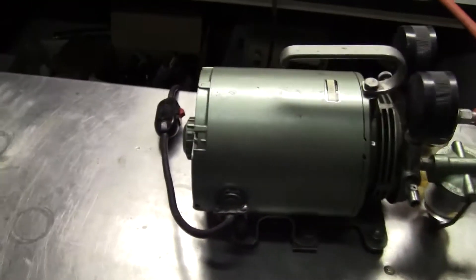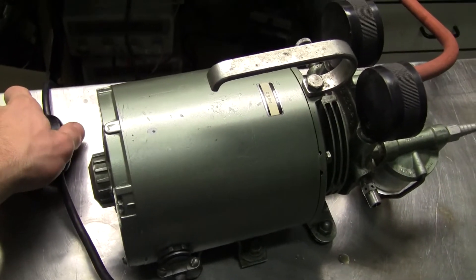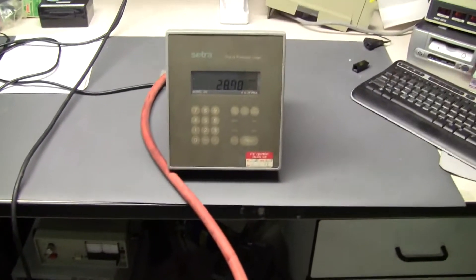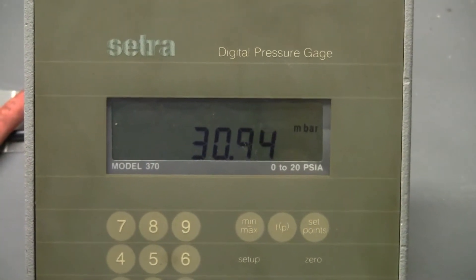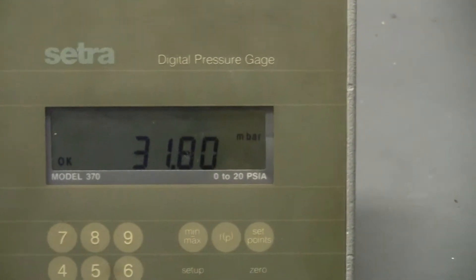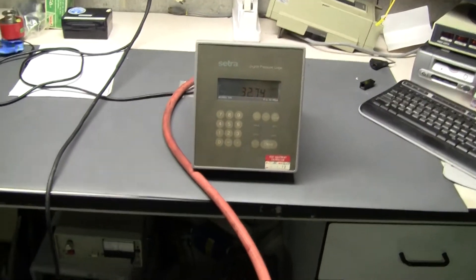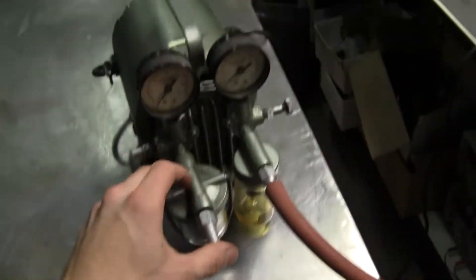Okay, let's turn it on. This is a 1/6 horsepower General Electric motor. It pulls about 30 millibar. Pretty quiet.